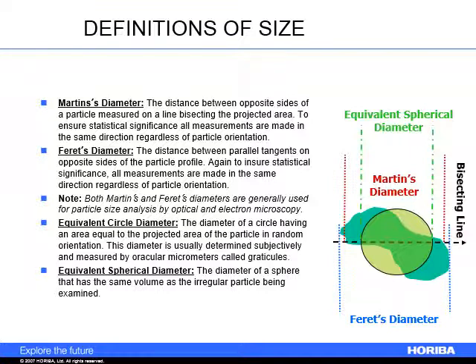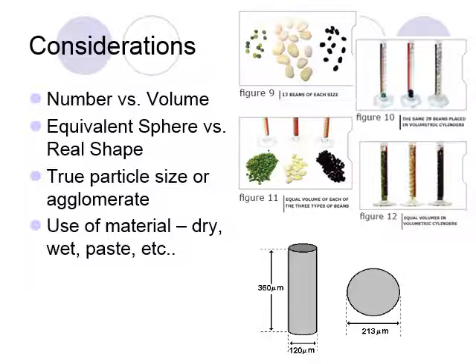These are just different mathematical definitions developed by somebody to help you compare particles and understand when your particles are not spherical, and how to do math that applies by calling things equivalent spherical diameter. Things like that end up being important for particle size work. So we go through.